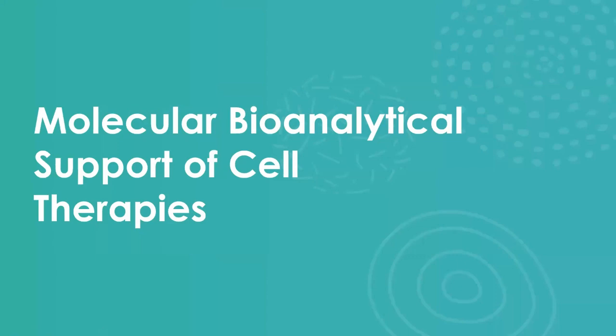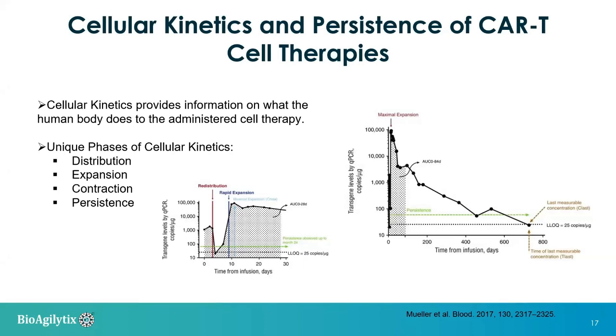Thank you, Shishin. So now I'm going to transition us into the molecular bioanalytical support of cell therapies. So you're going to see a lot of parallels from what Shishin just mentioned for CMC support in this section. So the first assay I'm going to be discussing is the characterization of biodistribution, persistence, and the cellular kinetics profile of cell therapies.